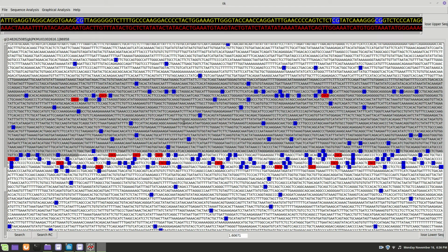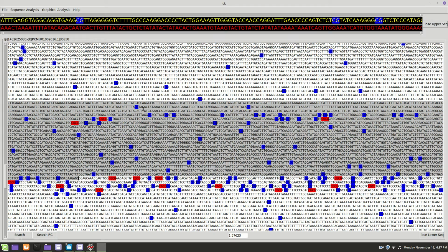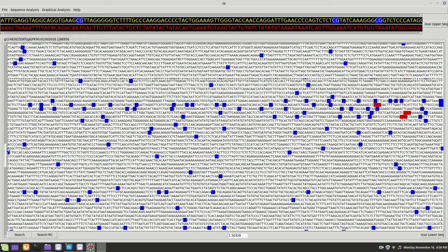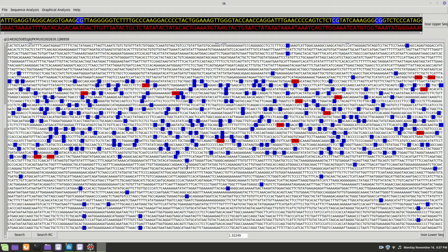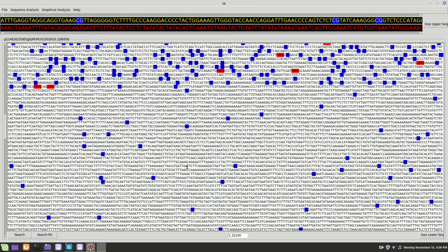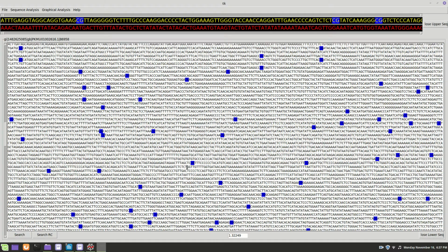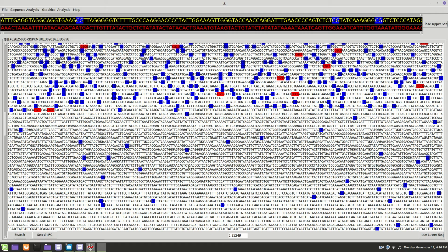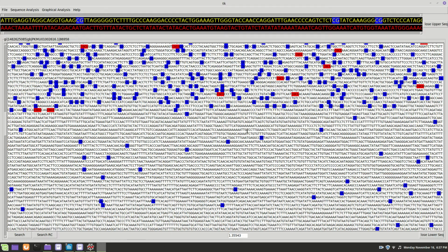So this is a smaller one. Now some of you are going to get much larger ones because I go to the next CpG island when I choose a gene, and there are probably genes in between there. So here, we're going to start somewhere up here in this one. Here's your CpG island, which is huge compared to the others, and which is fine. And then it just keeps on going for quite a bit of distance. Realize there are probably some non-CpG island genes in between there. So that's going to make it rough on you knowing where to stop.